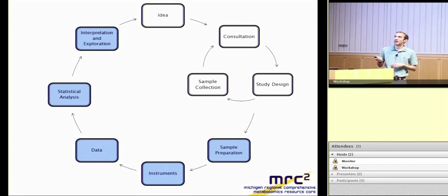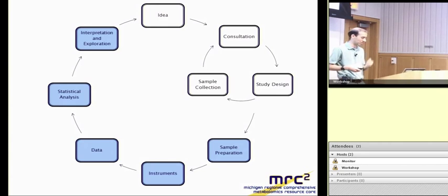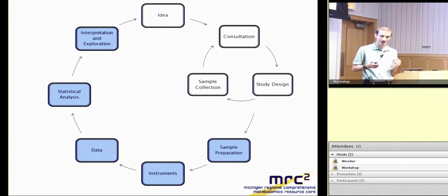I expanded beyond the three at the bottom, which was my talk yesterday: data, sample preparation, instruments, to include some statistical analysis and interpretation and exploration, because when we're looking at actual data, you can't really separate this part from the raw data and have anything meaningful. So I may not take it all the way to the level of, this is biologically a mechanism that I proved, and I can guarantee you that I won't, but at least hopefully it'll put things in a little bit more context.